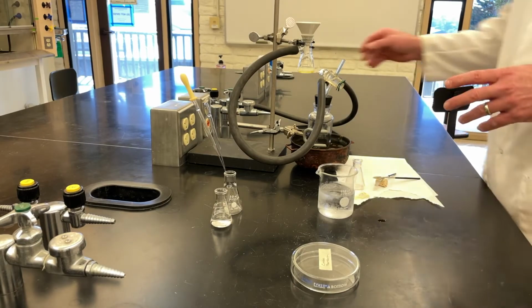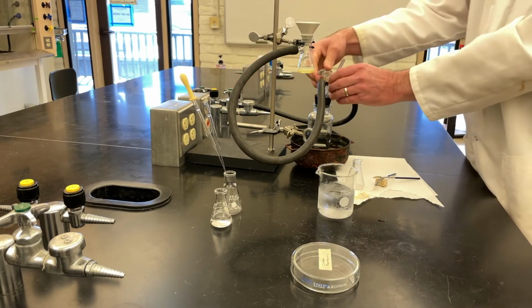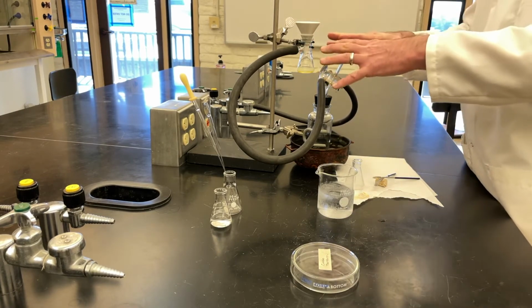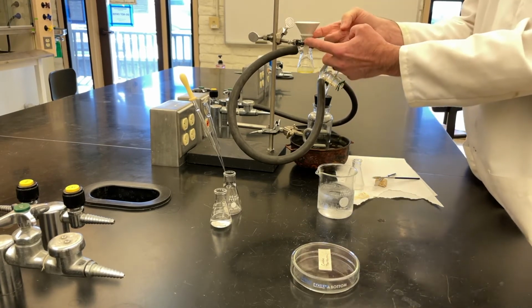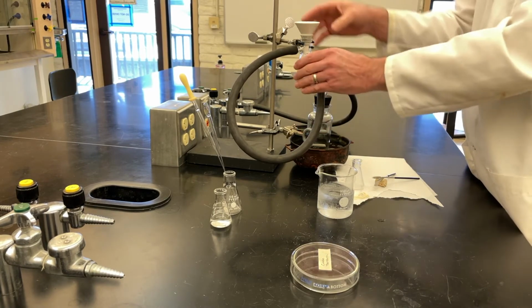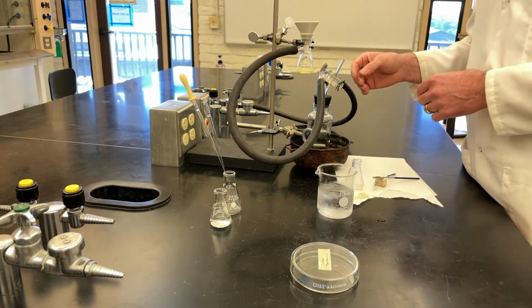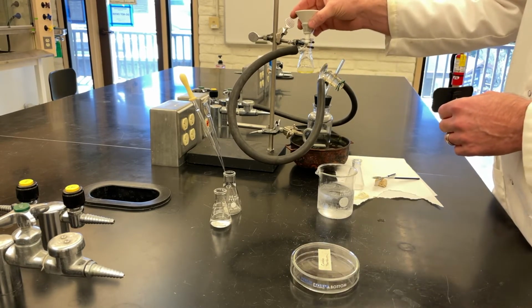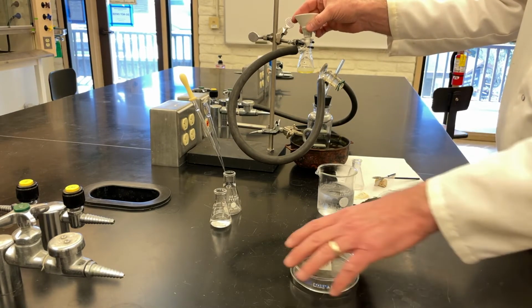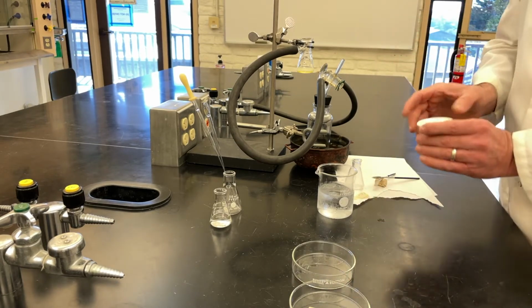Okay, so we're going to take this off the filter. We turn off the vacuum. We release the pressure. That just lets air back into the system because we've been pulling vacuum through it, and when that paper is wet, you can get some vacuum that is built up in the lines. If you don't release that, this Hirsch funnel is really hard to take off. So make sure there's no liquid sitting in the funnel. We don't want drops of liquid getting into our petri dish.